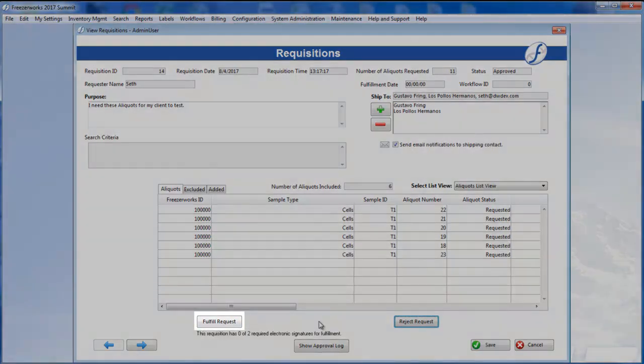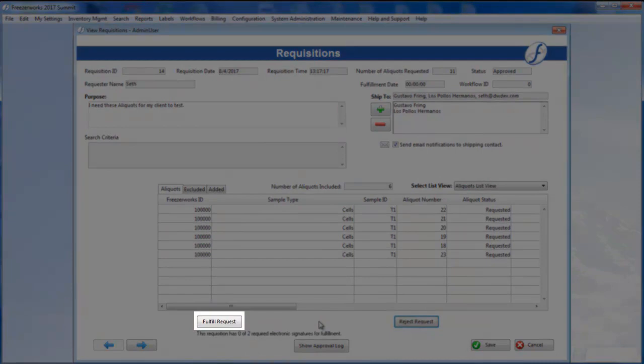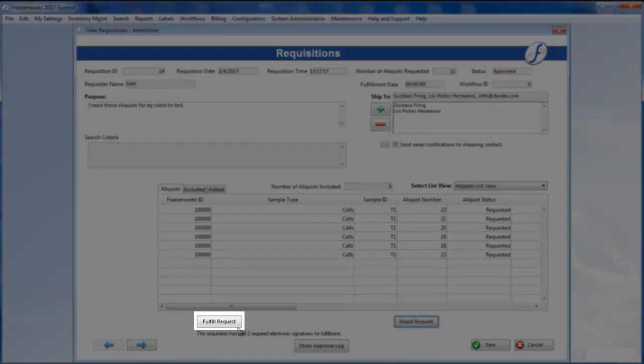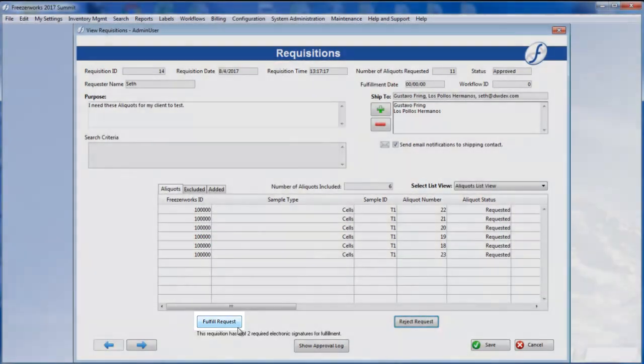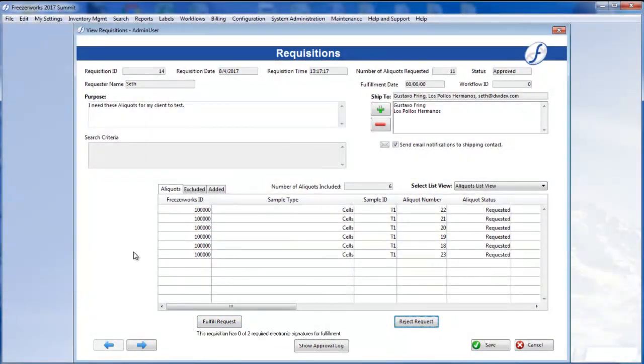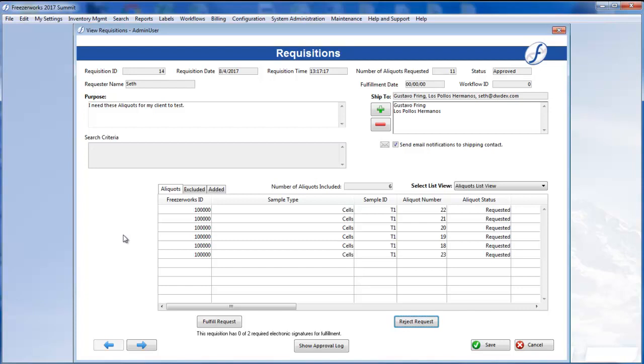This automatically changes the Approve Request button to Fulfill Request, and removes the Exclude and Include buttons from the form, as no more modification of the aliquots selection is allowed. To finalize the approval, however, we need to hit Save.